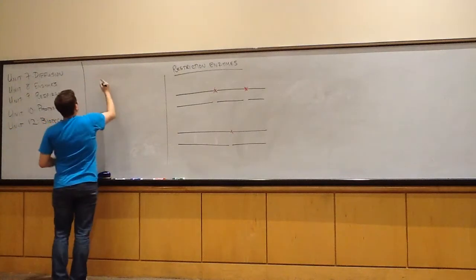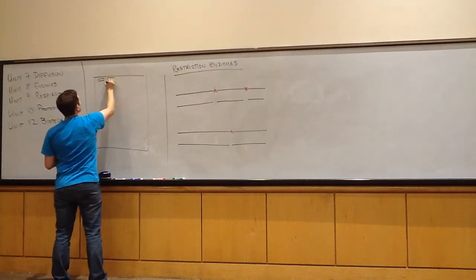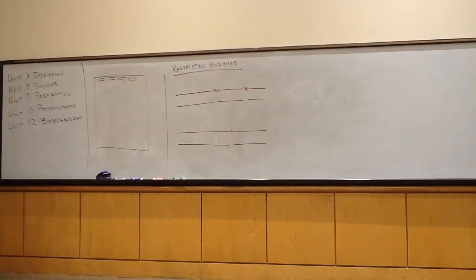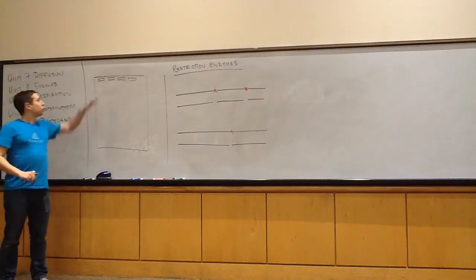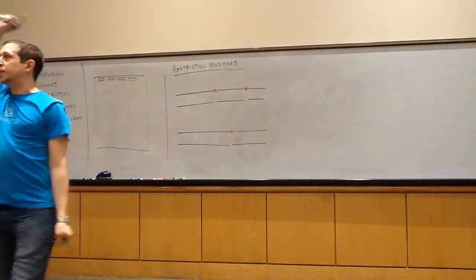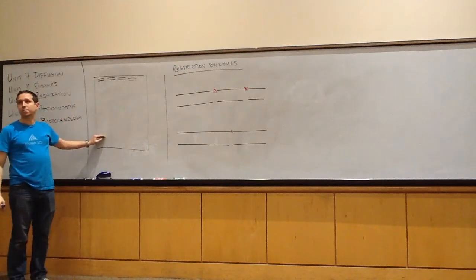In gel electrophoresis, you have an agarose gel that has these wells, and you put your DNA in there. We want to make the DNA run down the gel. Now, if we just put the DNA in these wells and let it sit, it's going to start diffusing in all different directions. We don't want that. We want it to go in this direction.